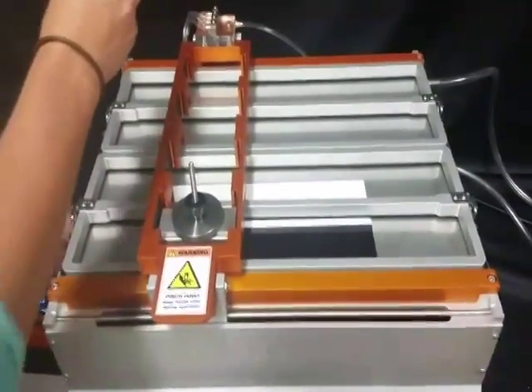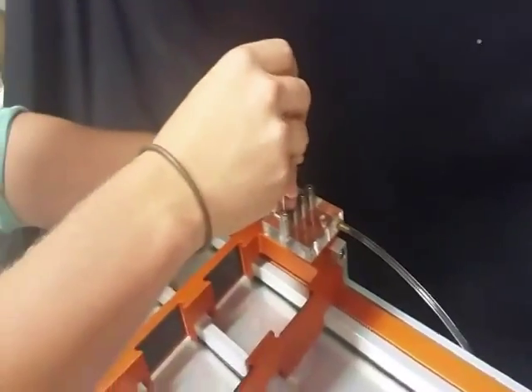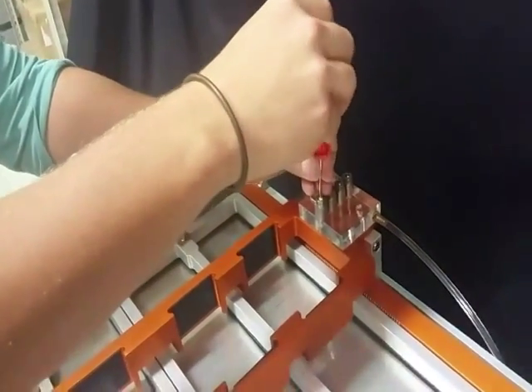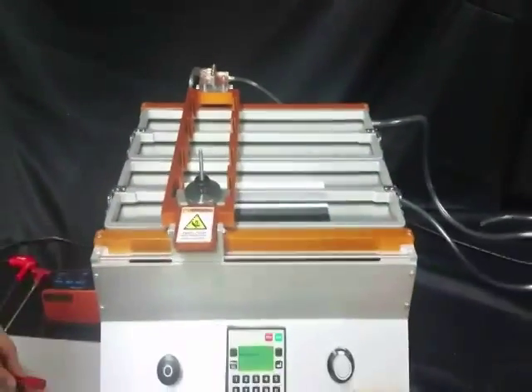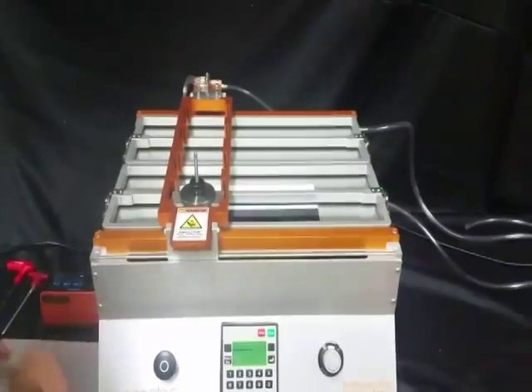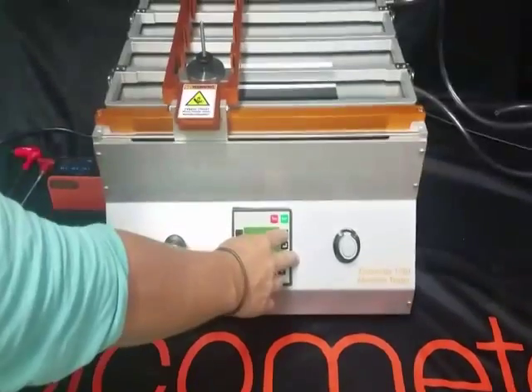Step 3: you will now open the flow control valve so that the liquid will drip onto the test panel during the demonstration. You will then turn the pump on and press start.